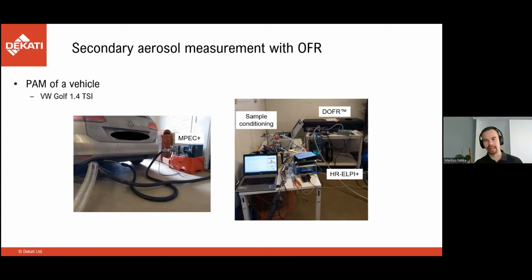If you have only purchased the reactor part, you get this separate control unit where you can control the ejector diluter pressure, so the flow through the reactor and the dilution, and you can select the number of active UVC lamps.